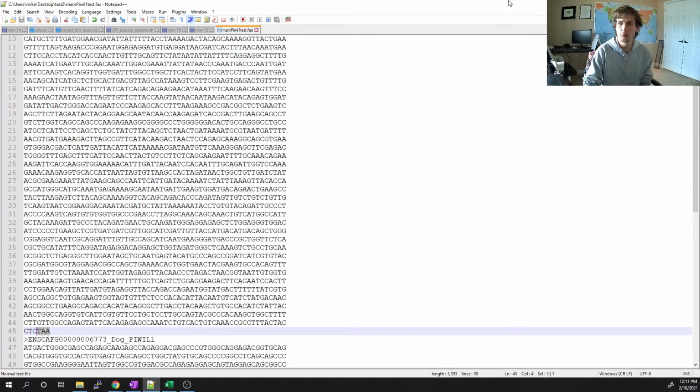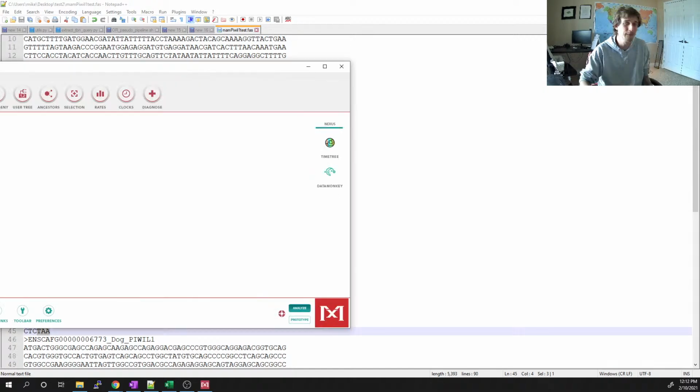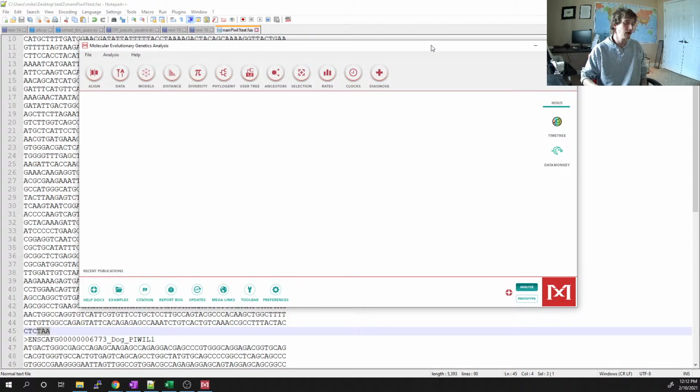So now I'm going to take a small, brief tour of Mega and how we can upload these sequences to Mega. All of y'all should have this by now. If not, today. Because we will keep using this program, certainly for the first couple of weeks.